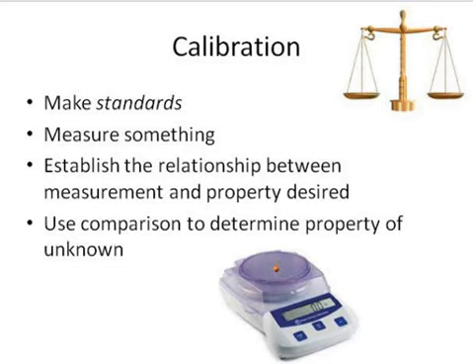And that person was clever enough to program this display here to read out mass in grams rather than electrical signal, which would be proportional to mass in grams. So some very clever engineers were involved in the process of determining that relationship and actually programming this device to read out directly the number that we would like to have.